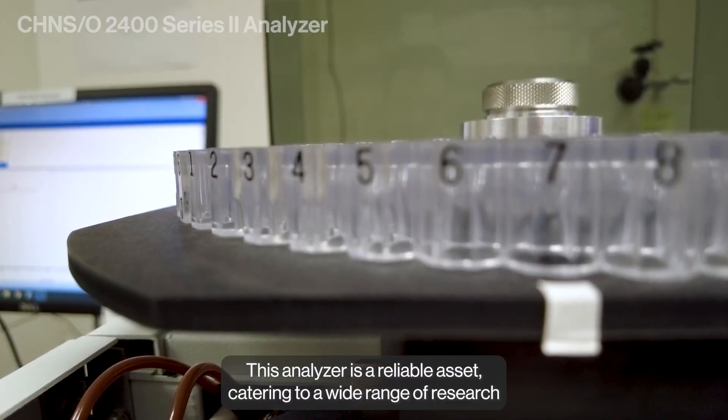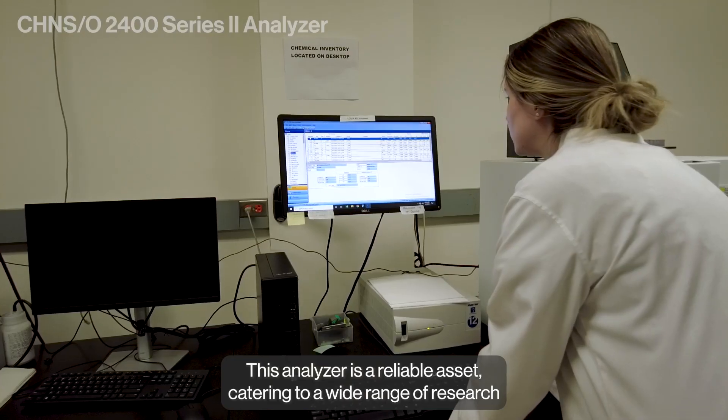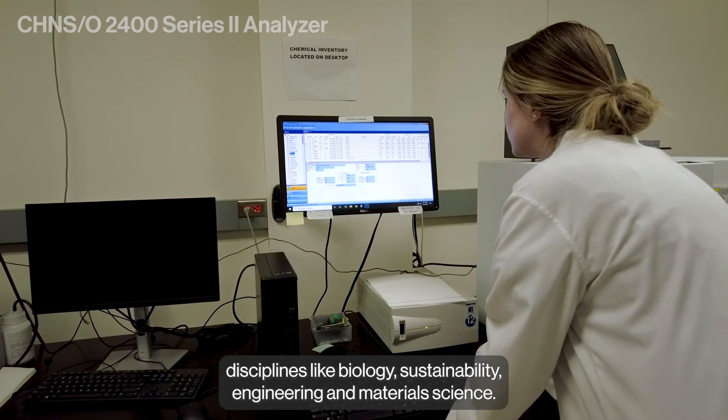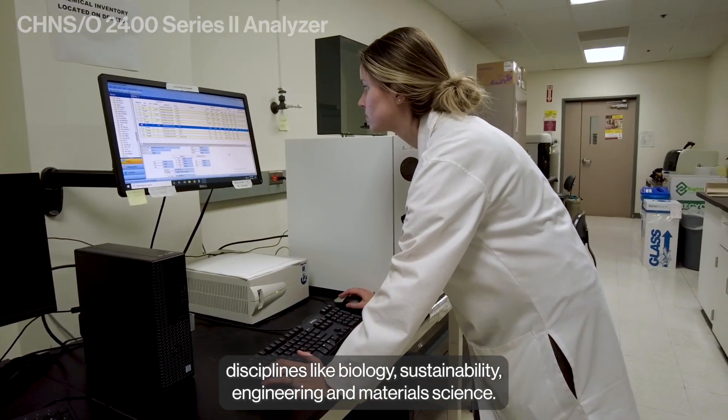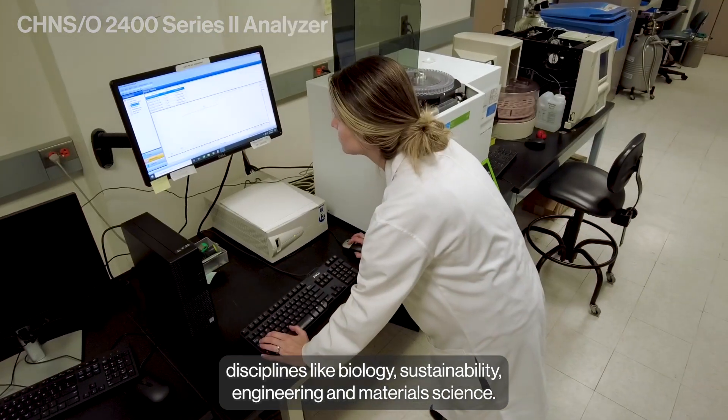This CHN analyzer is a reliable asset catering to a wide range of research disciplines like biology, sustainability, engineering, and material science.